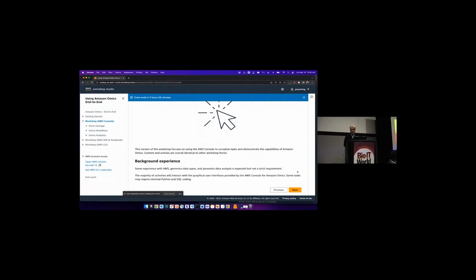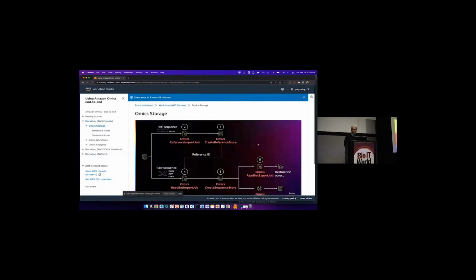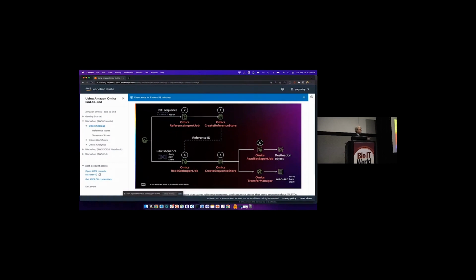And so the first thing we're going to do is, everyone here, that's the main question I have right now. Is everyone here and ready to click next and get going? I see a couple of thumbs up, thumbs up, thumbs up. Excellent. All right, so this is mostly self-guided. I'll give you a couple of overviews of what you're going to do, but then folks are encouraged to just work through the materials as they're written out.